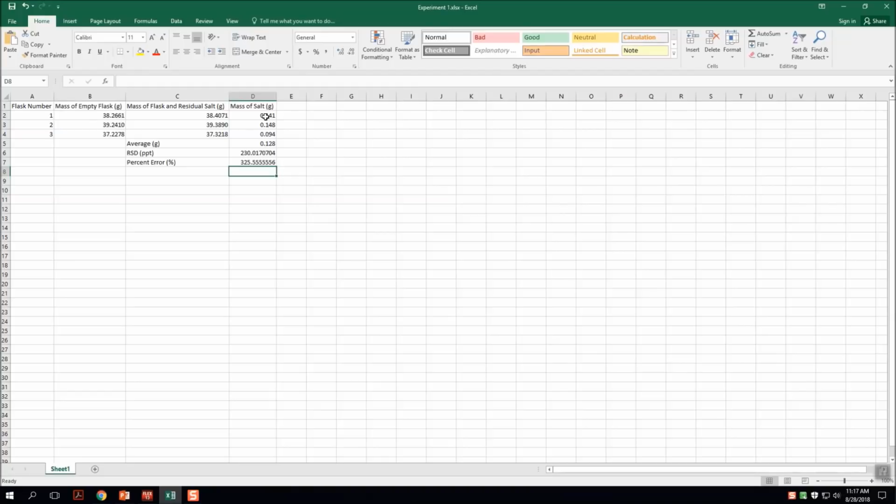Then clean and dry the flask. Rinse it out with water and wipe it dry with a paper towel. And then record the mass of the empty flask. If there's still an error, sometimes that happens because the flask was wet to begin with and you boiled off that extra water and therefore you still get a negative mass. But sometimes it fixes the problem. And it certainly fixes the problem if you forgot to record the mass of the empty flask to begin with. So that's basically just a common error that happens that we wanted to try and help you fix.